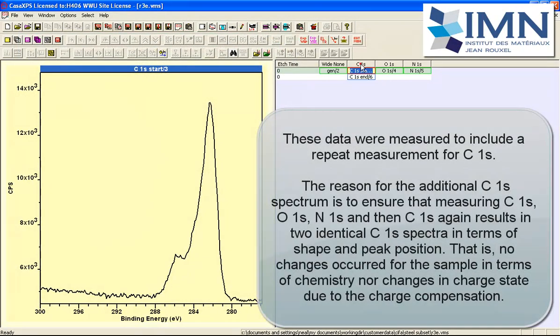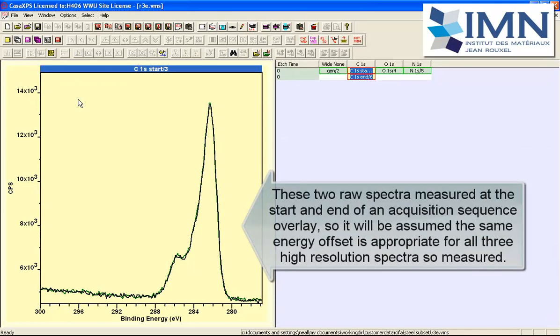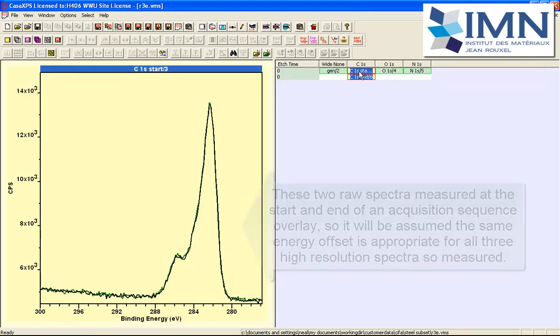This measurement in particular has measured the carbon 1s twice to verify that after a sequence of measurements the two carbon 1s spectra that ought to be the same are indeed the same and that's what we see. So this is designed to ensure that the measurement was stable in terms of charge compensation and other possible influences of the x-rays on the material itself. But nevertheless you can see that the charge compensation has remained constant over the sequence of these measurements by virtue of measuring this carbon 1s twice.